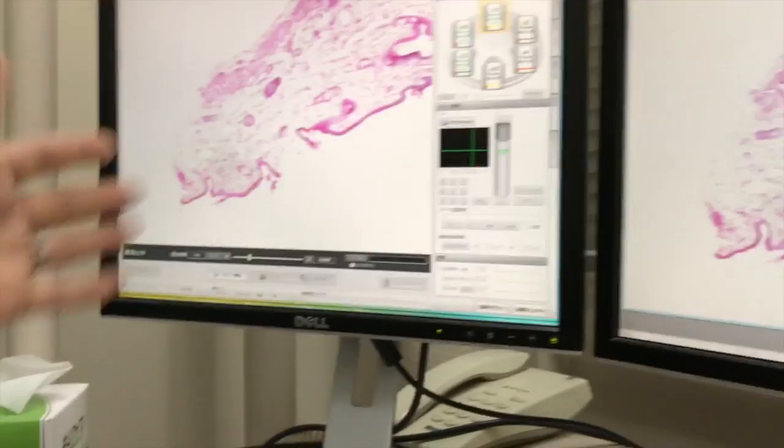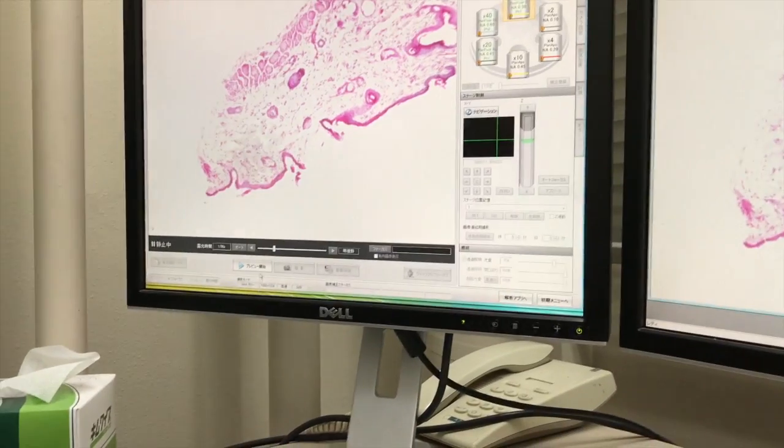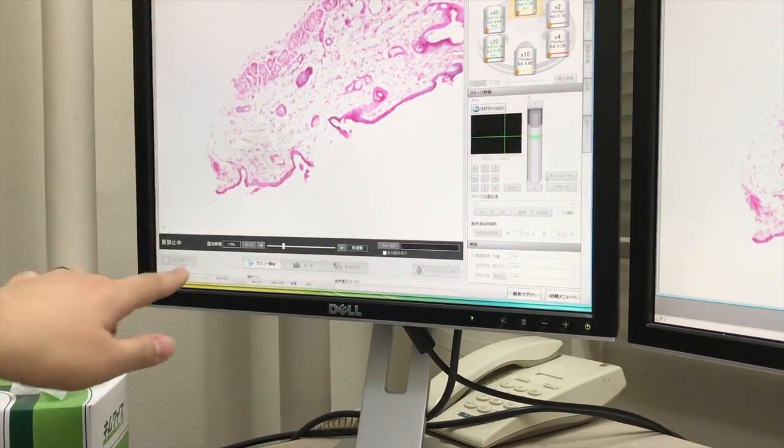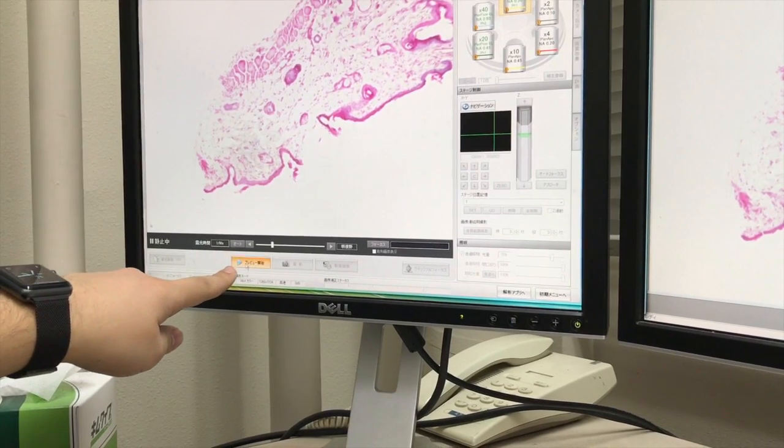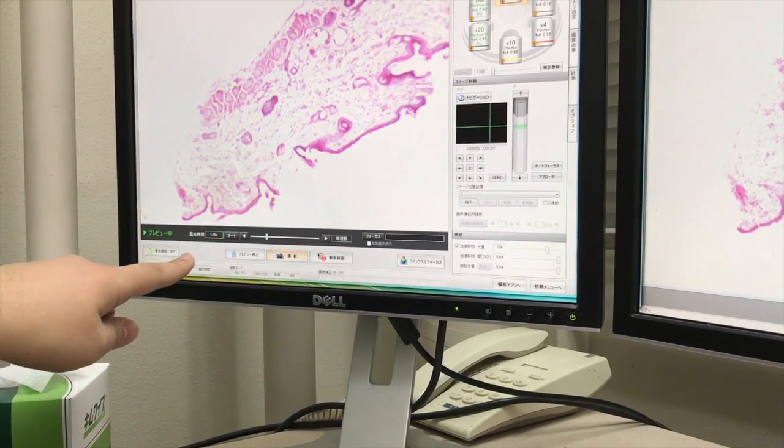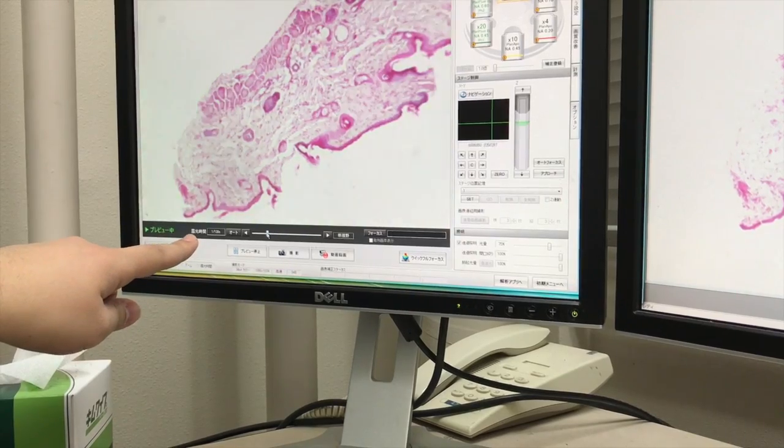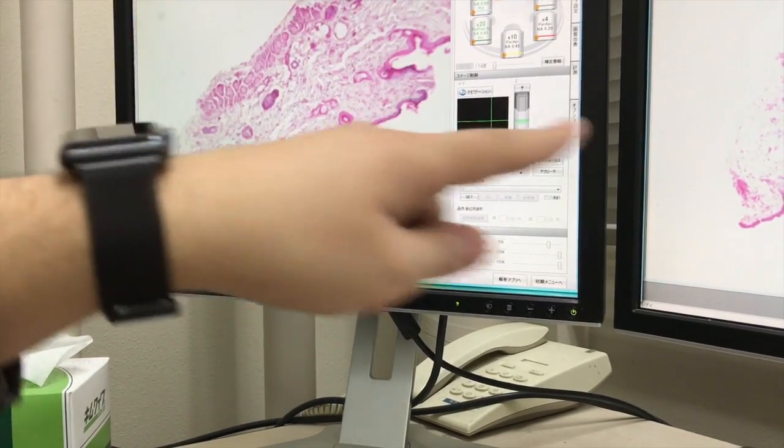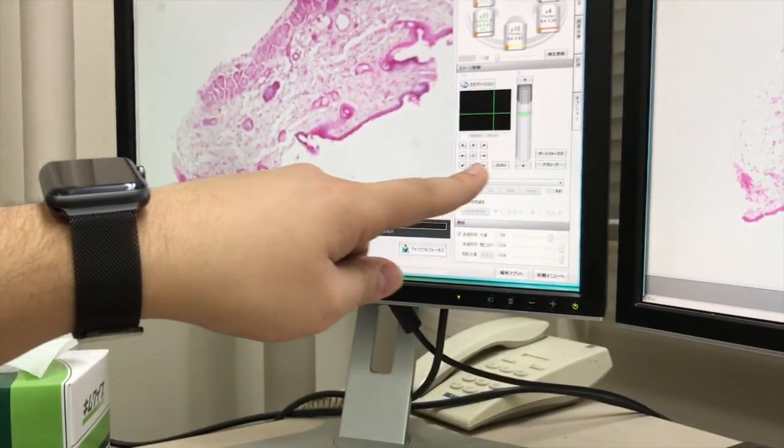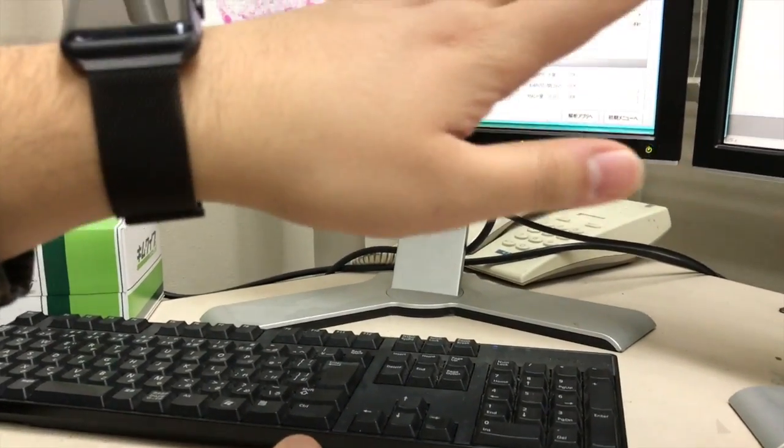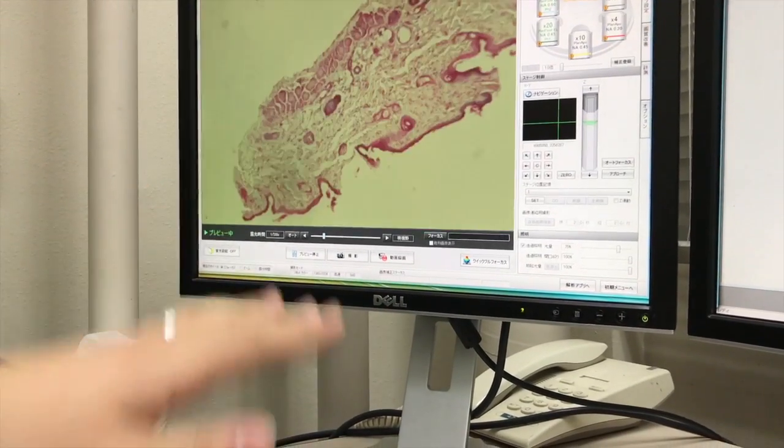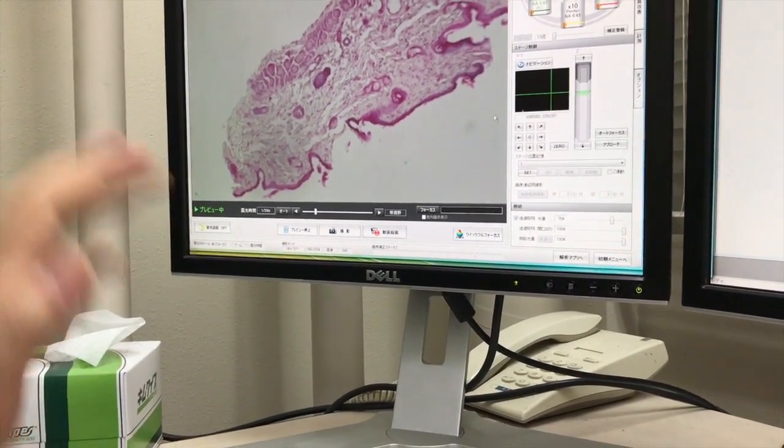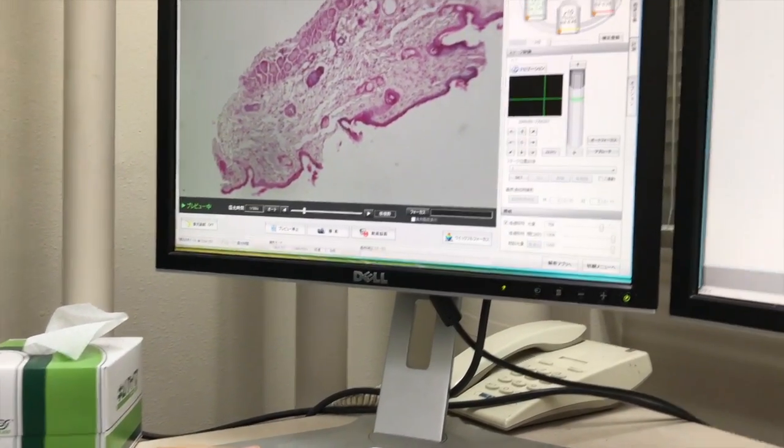And also you can adjust the light exposure in here. I see. It does. This image is too bright. You can adjust the exposure. You cannot do it in here. You cannot do it at all. It should be better to here. But you can here... We can do it here, but it's like Photoshop. Yes, yes, yes. But this is the actual. Yes, yes. Okay.